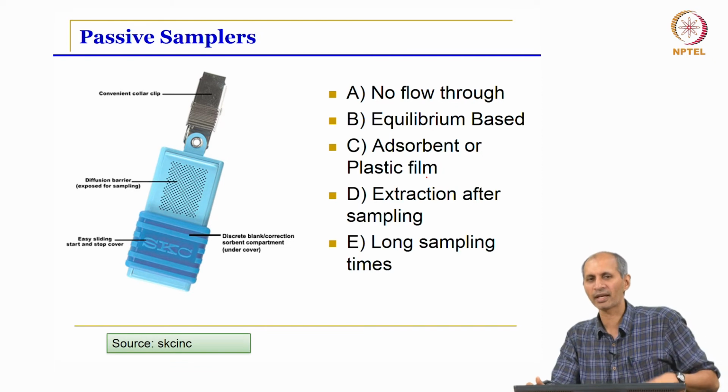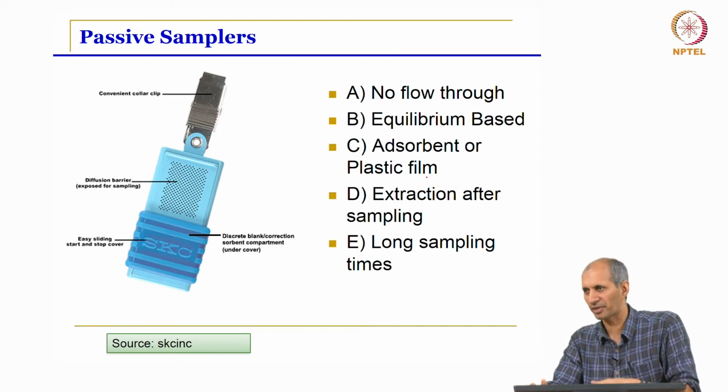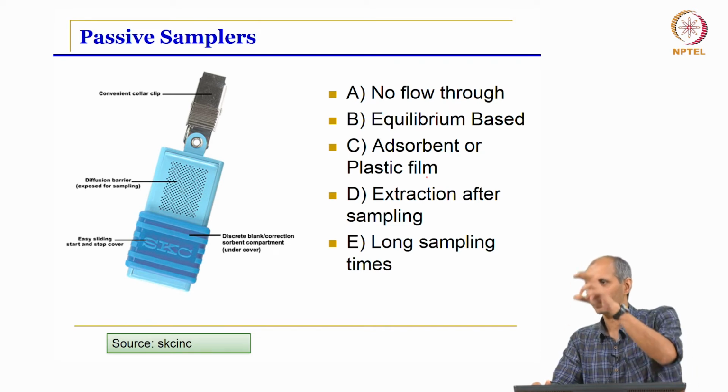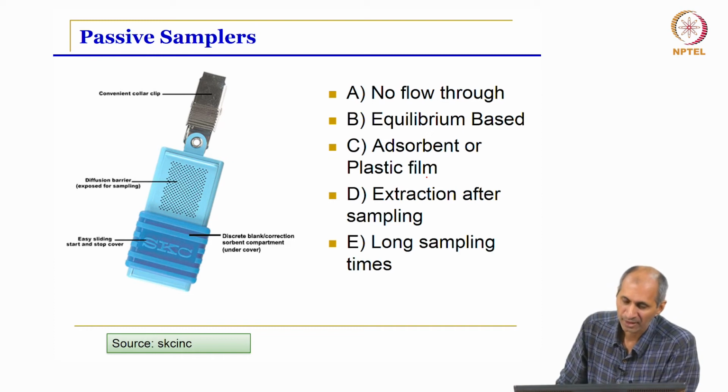Active sampling is where I am actively pulling in a certain volume of air. But the problem is I need a pump, sometimes I need electricity, sometimes I need somebody there, and some things may be stolen and all that. So the logistical problems are there. So what people have come up with is what is called a passive sampler.